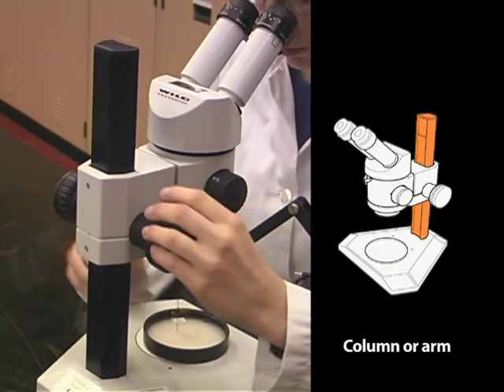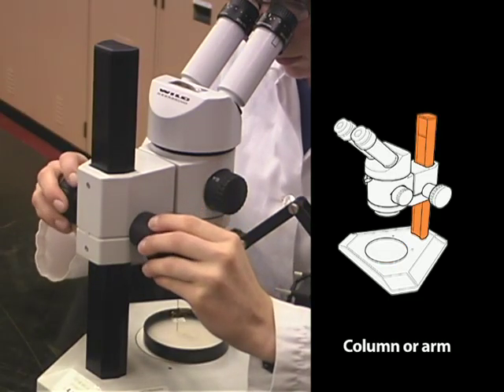In a stereo microscope, a column or arm connects the stage to the rest of the microscope.